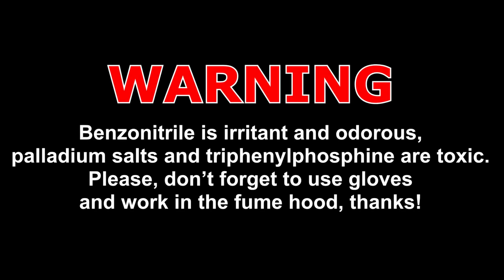Benzonitrile is irritant and odorous. Palladium salts and triphenylphosphine are toxic. Please don't forget to use gloves and work on the fume hood. Thanks!